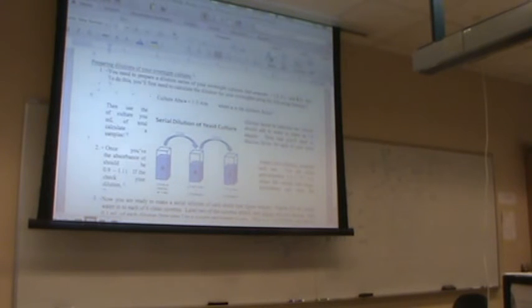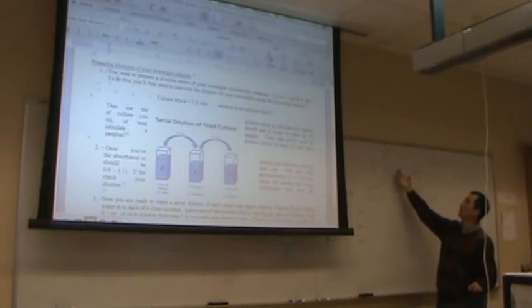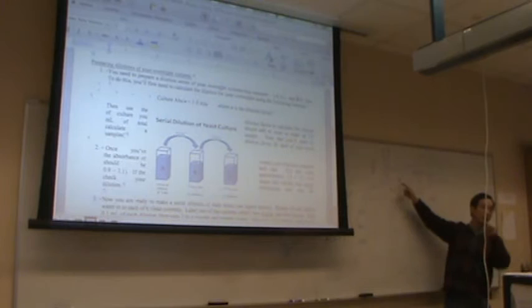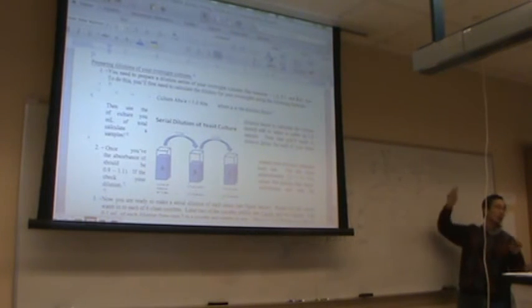So, okay, once again, the centrifuge is now spinning down the cells downstairs. After spinning down, the water will just be decanted, and then to the cells at the bottom of the tube we're adding 100 microliters of water, take everything, and put it in the small Eppendorf tube. So we should now have 3 small tubes, wild type, vector, and mutant, all in 3 separate small Eppendorf tubes. Do we need to mix these up?